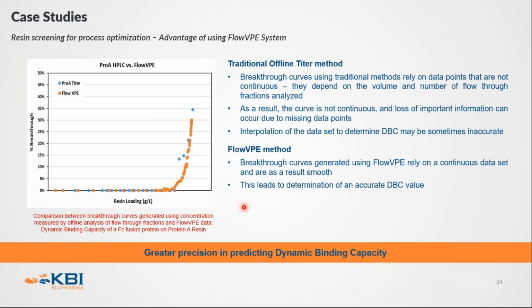So we flush it out with a lot of water, and if needed, we flush it out with a little 0.5 molar sodium hydroxide solution also. Before every use, we load the cell again and check transmission. If the transmission passes, it is good to go. That is really all the maintenance we do; we just have to make sure that we are storing the flow cell clean.